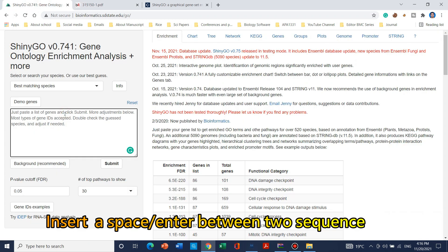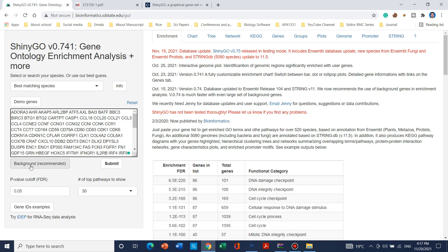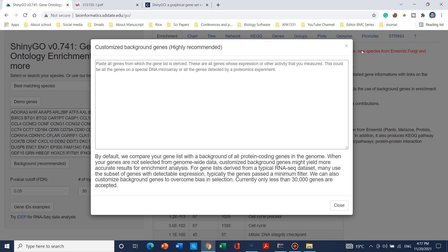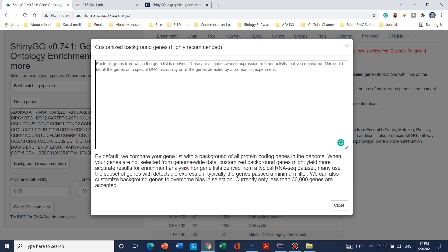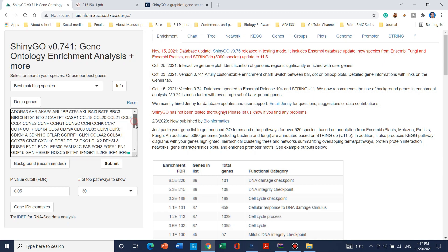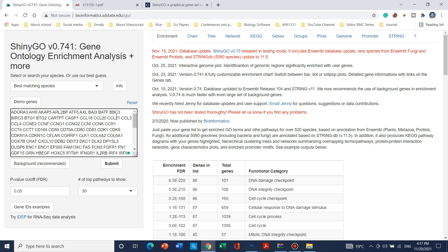Let's take an example. Here is a list of 147 genes. When you copy and paste them, the website will show another tab for background, which is recommended. Here you can paste the list of all unfiltered genes which you initially received from your company or data analyst. From that original list you have selected this specific set of genes. If you don't have it, you can simply leave it empty, but it is highly recommended to provide the original list for better and more accurate results. If left empty, the website will use the whole genome online data to build enrichment analysis.